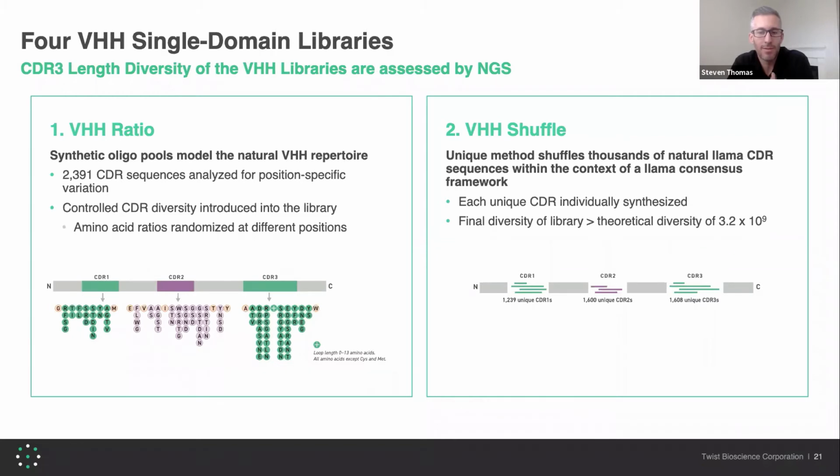These can be used to access epitopes that would traditionally be sterically hindered by a standard IgG. Once discovered, these antibodies can be used as building blocks for bispecific or multi-specific antibody development. And we typically see tight antigen binding using this type of antibody format.